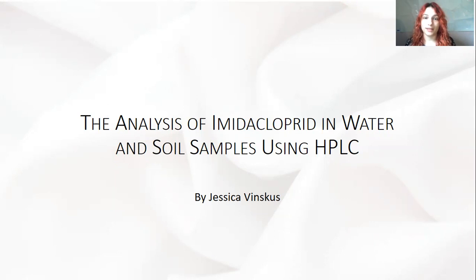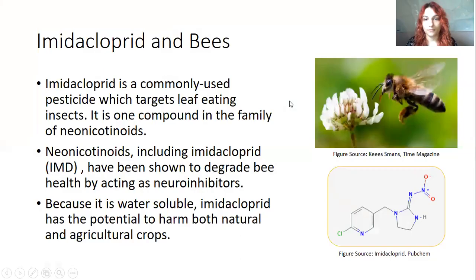Hello, my name is Jessica Vinskus, and my research was on the analysis of imidacloprid in water and soil samples using HPLC. So let's start off with what imidacloprid is.